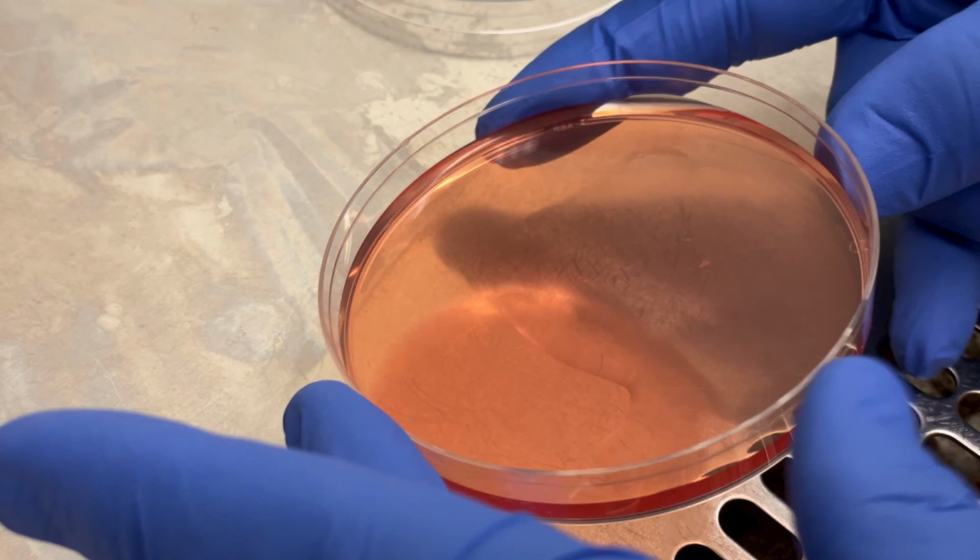You can do this in different ways, but the thing is to avoid a physical spreader, which is used for some other types of organisms. These are then dried and used, incubated for the period of time required, and then colonies can be observed under the stereo microscope.